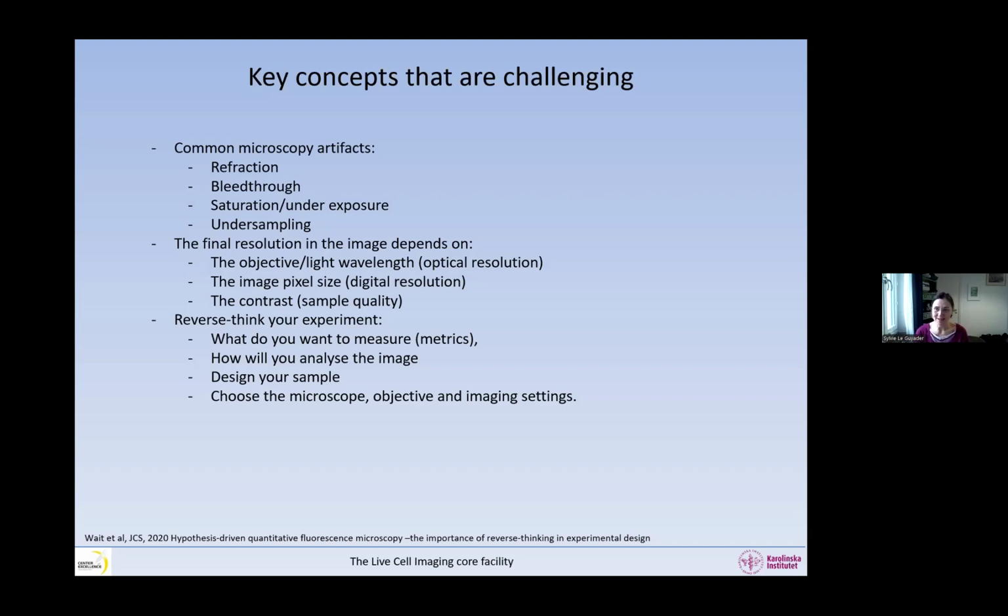I'm going to prepare all my samples and then I'm going to image everything and then I will think about the image analysis. This does not work.